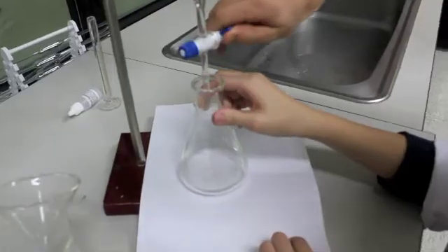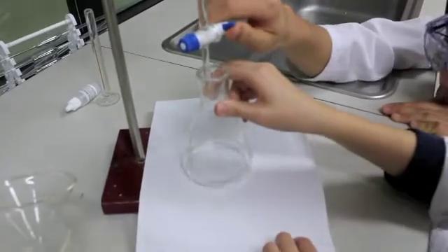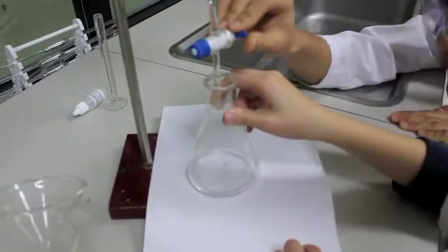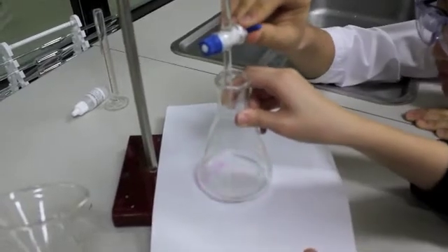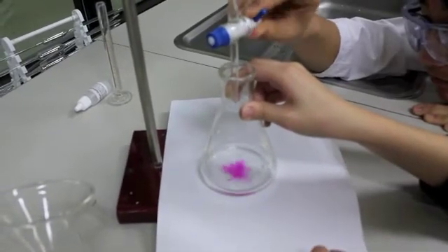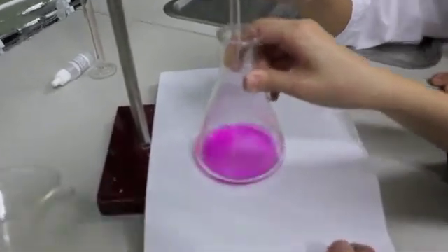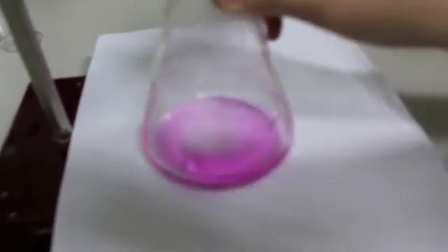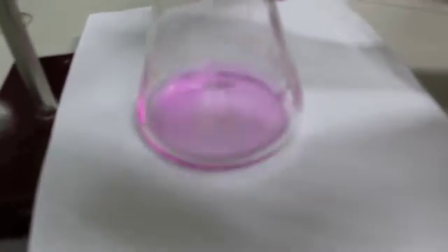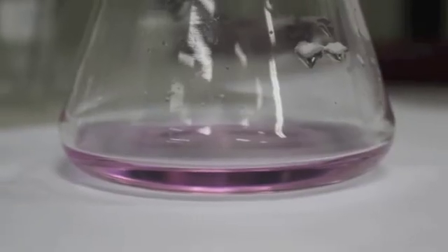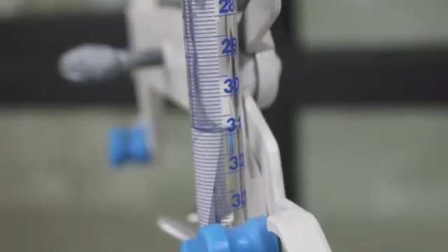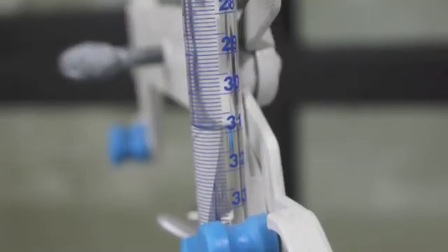Note the initial point. Here is the point where the endpoint has been reached, when the color is completely changed. Note the meniscus at this point as your final volume. Remember not to go beyond the 50 point as accurate measurements cannot be made.